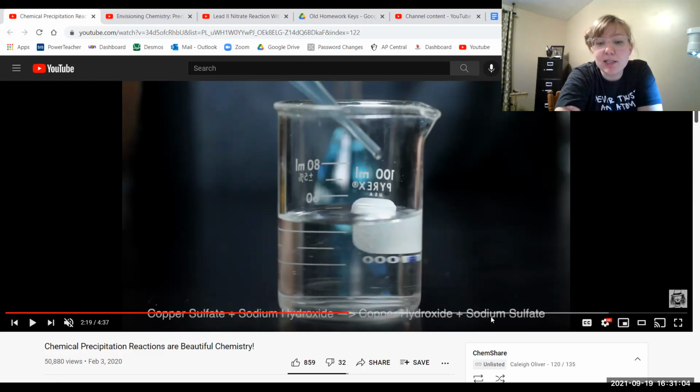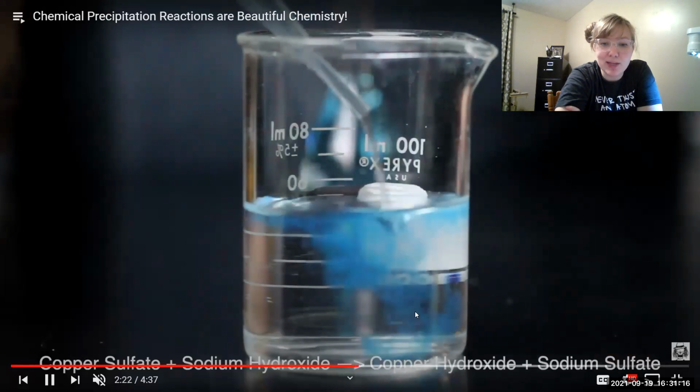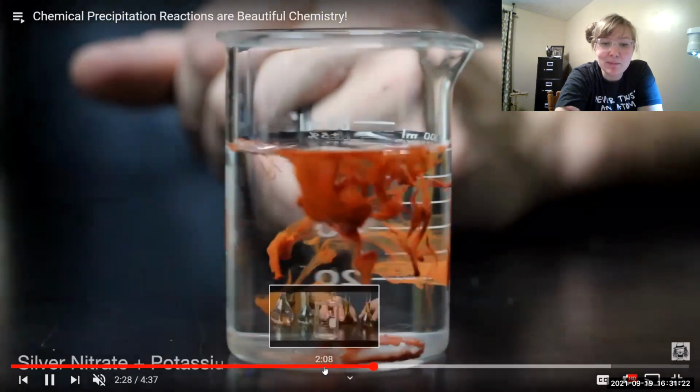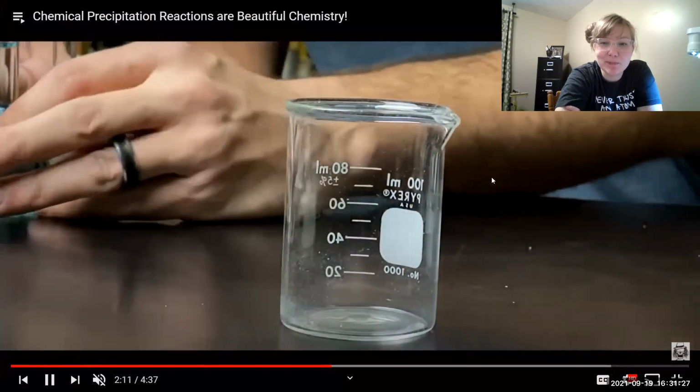Copper hydroxide, sodium sulfate, one of those is not soluble because watch what happens. We're getting a precipitate forming. You see that blue? Ooh, that's pretty. That was cool. Let me go back because I want to see that again.